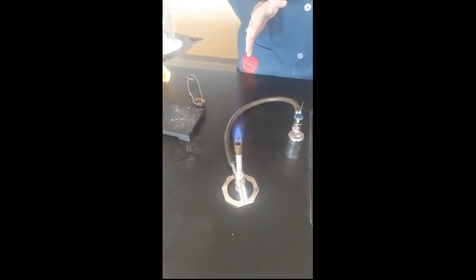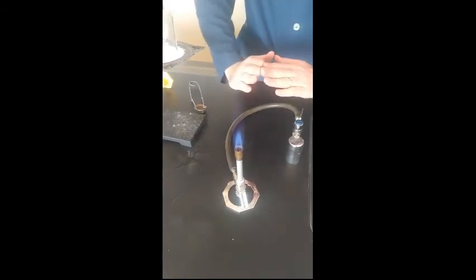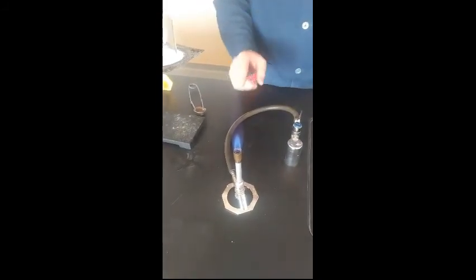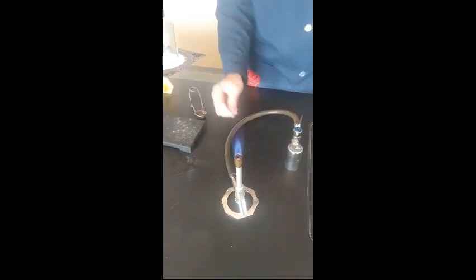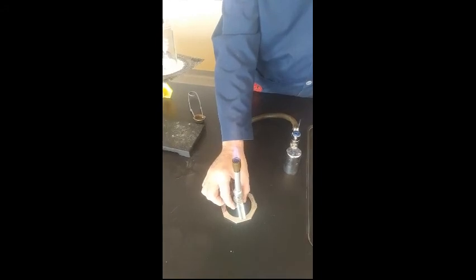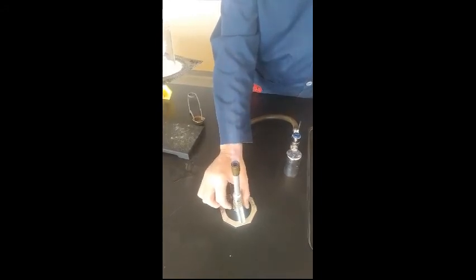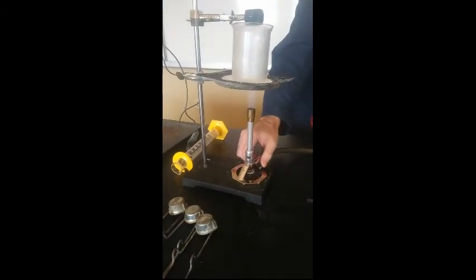Notice I'm not putting my hand through that, okay? Now, you see the tight blue triangle there? That is where all the heat gets focused, all right? Now, we want that tip to be just underneath where the beaker is. So we adjust it by turning the gas adjustment valve. Remember, that changes the height. We can make it go lower, we can make it go higher, all right? So we want to adjust it when we put it underneath here, so that the tip is just underneath the beaker, all right?